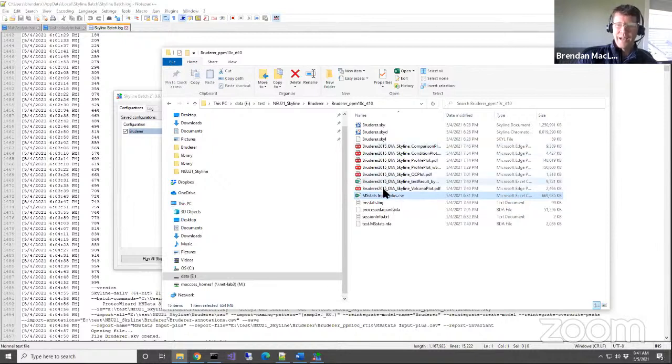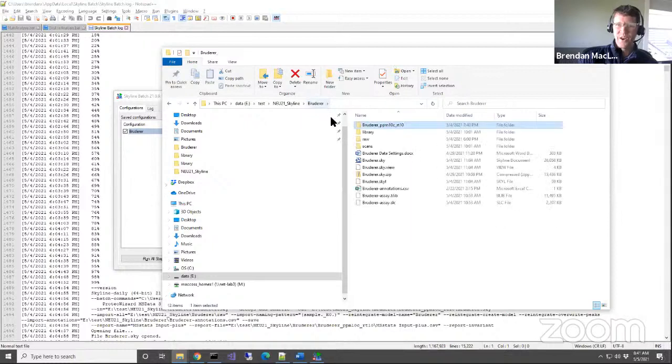So we've done a lot of processing and gotten data directly out of Skyline. And this is the fully processed Skyline file. For those of you who have both, if you only have Skyline Daily installed, which is what we're using, you should be able to, if you got this far, the people who said, hey, I successfully ran everything, you would have a folder here.